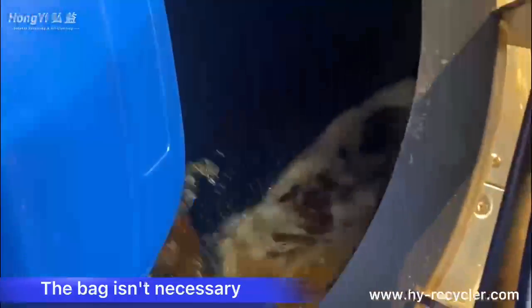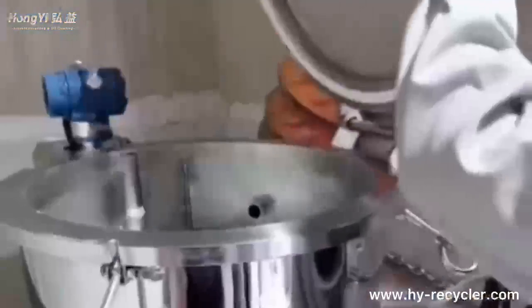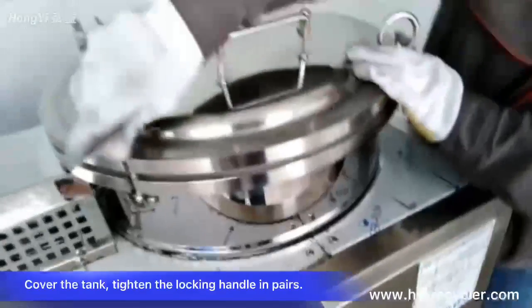Note: the bag isn't necessary. Cover the tank and tighten the locking handle in pairs.